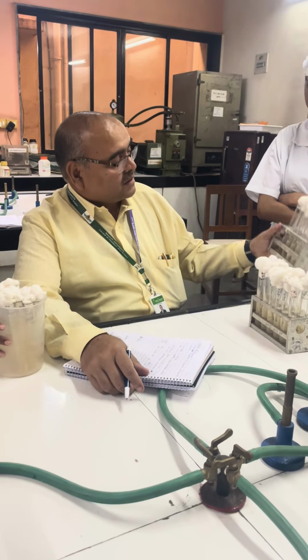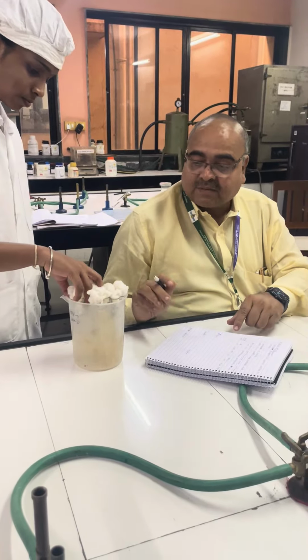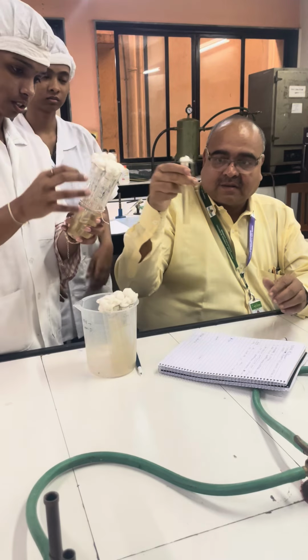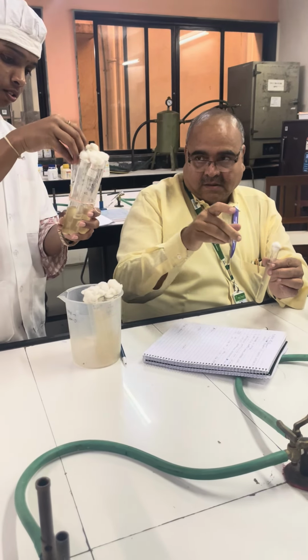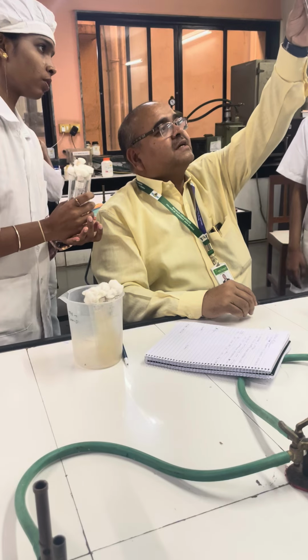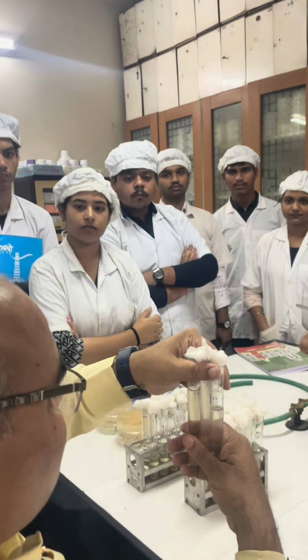What is this? Which one? Have you added the litmus paper to that? Tell me one thing: the number of test tubes from the first row showing acid and gas production. Pick up the 10 ml, the 3 test tubes of 10 ml. No, hold that test tube in hand. Remove that. That is also 10 ml. This one is 10 ml. Have you done the addition? See the number of test tubes showing acid and gas production. Come on this side. How many test tubes are showing gas production, acid production? 1. That means this result is 2.